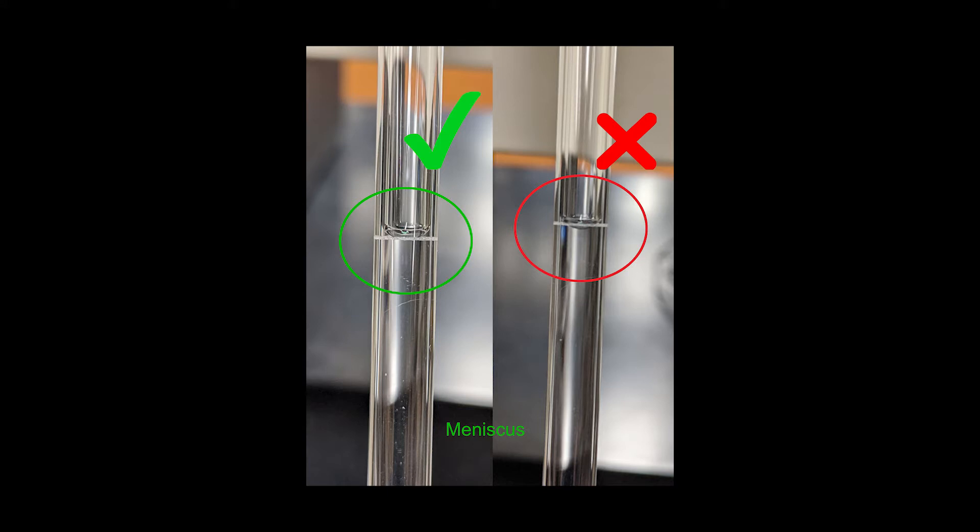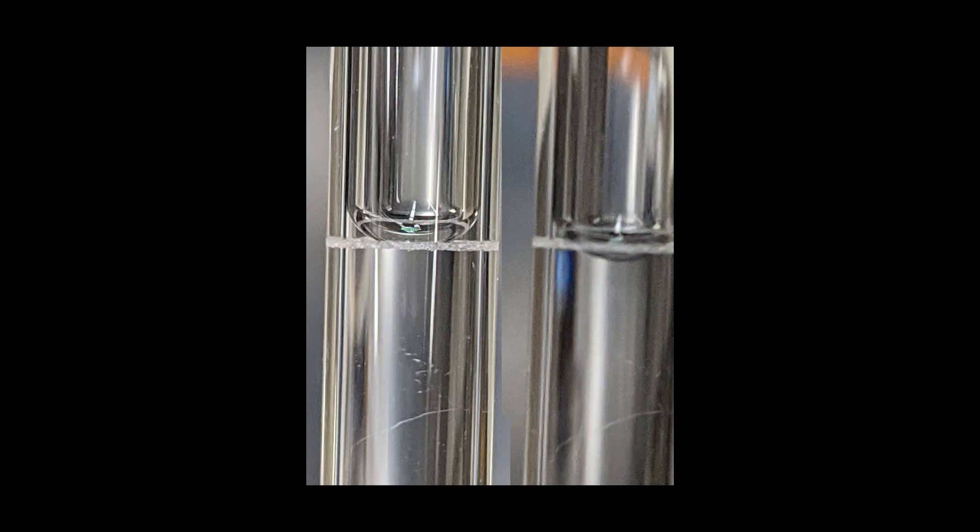This image shows the fill line on the volumetric pipette with the meniscus at the line and slightly below the line. You want the meniscus to sit on the line for accurate volume measurement.